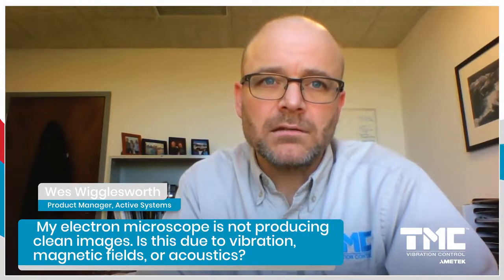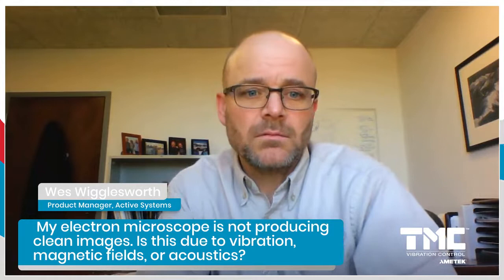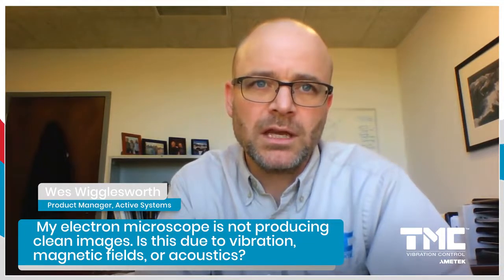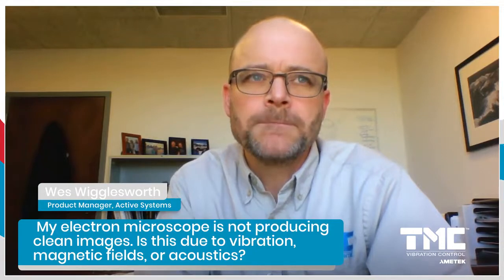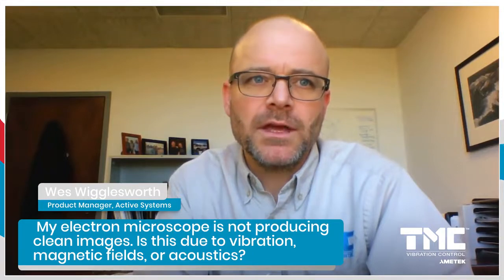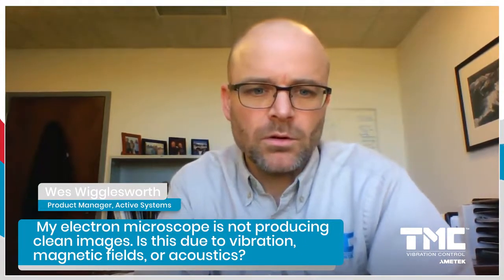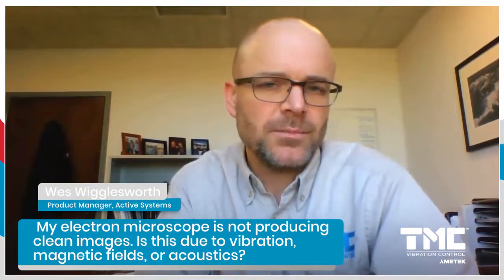You'd have the data, and the microscope typically would have a specification along with it, a published specification. So almost all commercial microscopes, in particular electron microscopes like scanning electron and transmission electron microscopes, have a published specification from the manufacturer that says, here's the threshold that you need to be under for floor vibration or magnetic fields or acoustics.